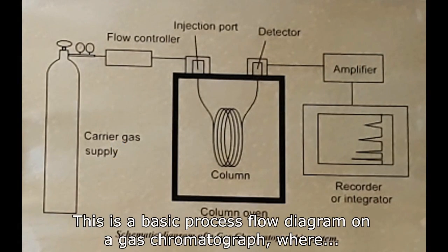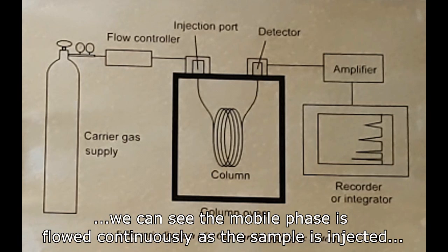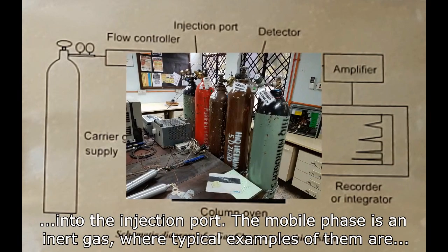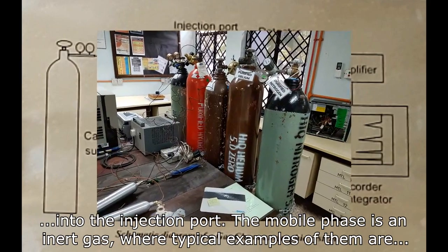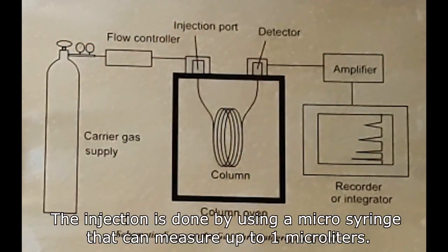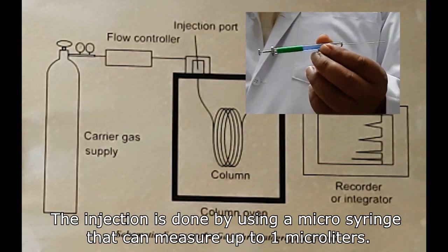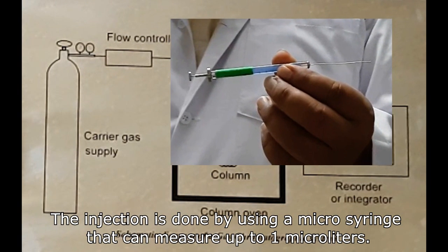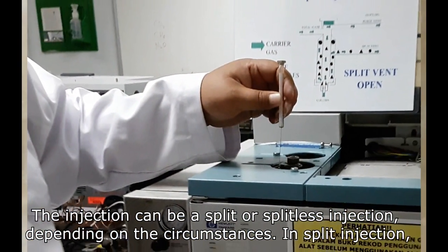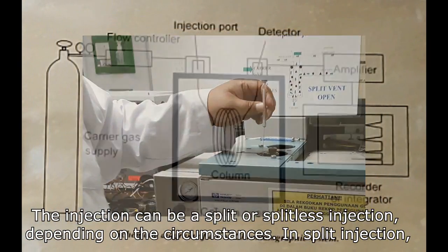This is a basic process flow diagram of a gas chromatograph, where we can see the mobile phase flowing continuously as the sample is injected into the injection port. The mobile phase is an inert gas, where typical examples are helium gas and nitrogen gas. The injection is done using a microsyringe that can measure up to 1 microliter. The injection can be a split or splitless injection depending on the circumstances.